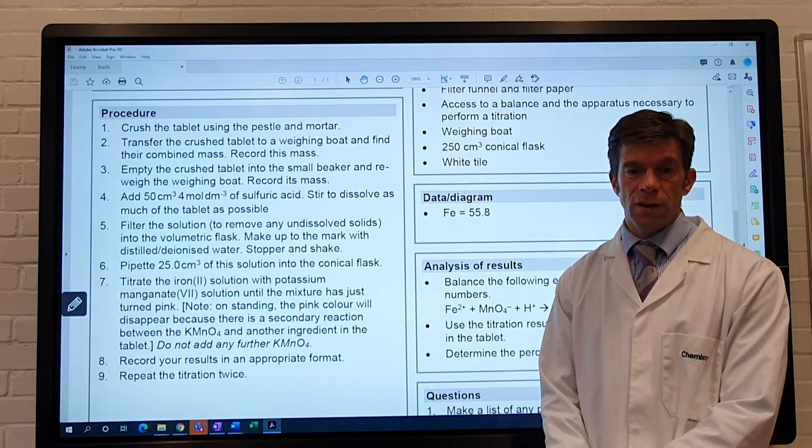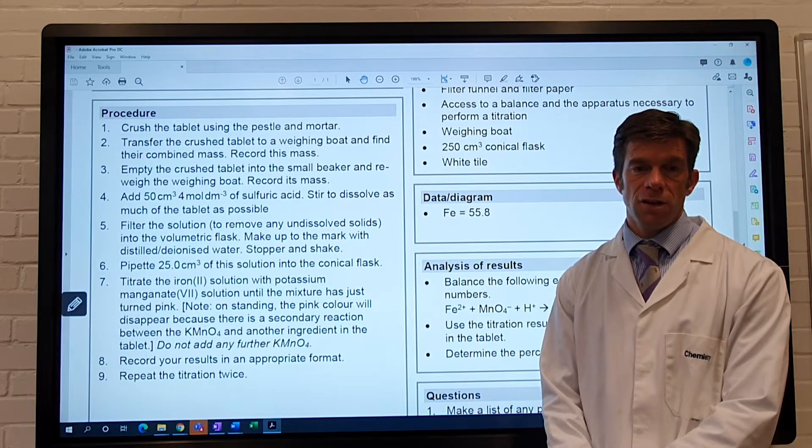Record your results in an appropriate format and repeat the titration twice.